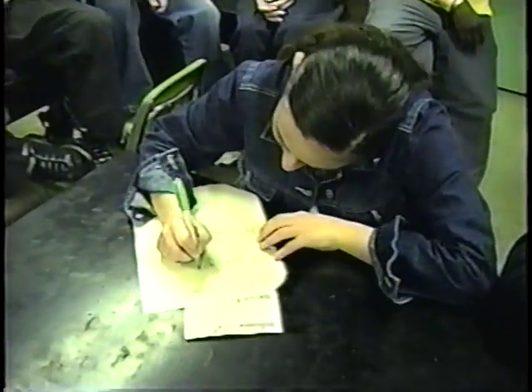Okay, Frankie, what you got? 54.0. If you could write that down next to the weight, 54.0. Okay. We got the weight, we got the volume. Mathematically, how do we get the density? Weight divided by volume? Yes, weight divided by volume.